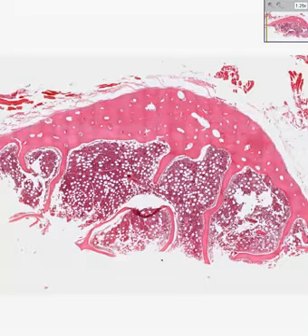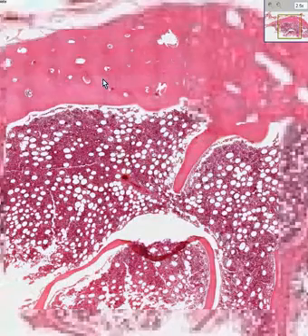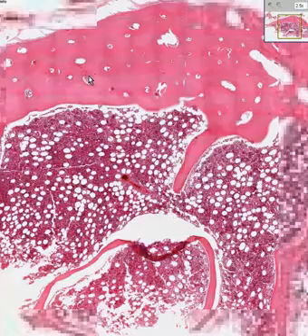Here is another section of rib, and like any section through bone, bone has to be decalcified in order to make a proper cut through it, which means you take the gritty elements out of it, the crystalline elements, and then the bone actually becomes soft, and you could cut it like it was soft into very, very thin slices. This very much resembles the last piece of rib that we saw.